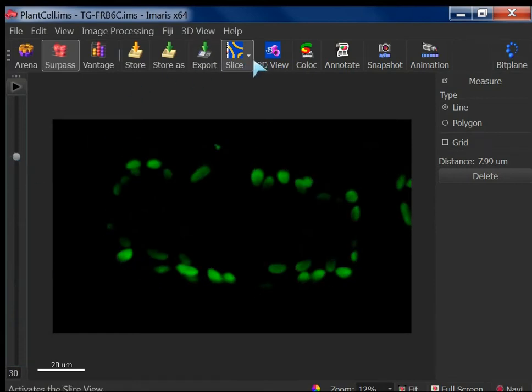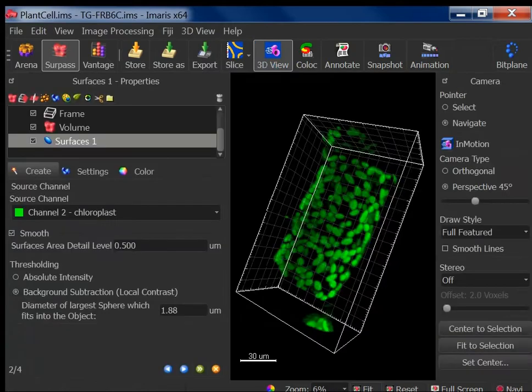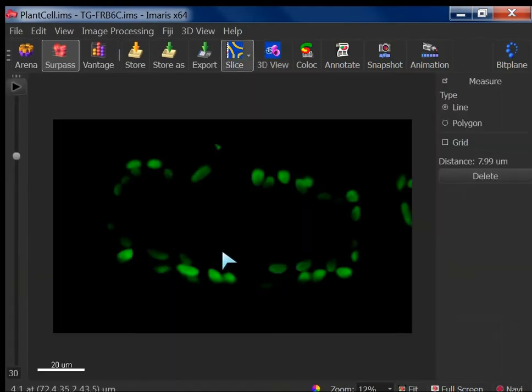Yes. So in the absolute intensity, when you are very sure about this, you understood what is displayed there? So that's 1, right? 1, 0, 1, 0, maybe 0. In this case, I would actually not use background subtraction but go for absolute, because I'm very sure that the background is background and foreground is very high. You see, foreground is very high, 94.